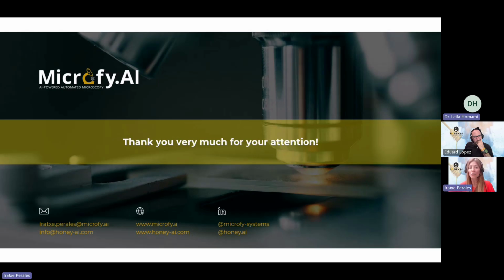Thank you so much. Okay, for the validation, the 53 samples was a validation specifically for a client. As I said, this is from the Arbitral Agri-Food National Reference Laboratory in Spain. All EU members have an inspection food control laboratory. All of them do routine analysis of different foods, not only honey, but one of the foods is honey. And pollen analysis, as you might know, is very important.